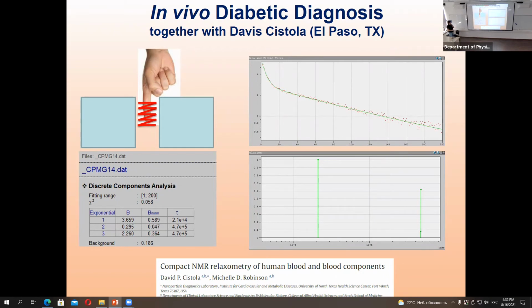in the risk area. And so for him, we built also the magnet that is not really shielded because you are able to put your finger inside. So now he's writing papers and then talking at different conferences. Here is, let's say, the reference. Very interesting project and very useful, by the way, for people. You can put your finger, wait 30 seconds, and then the system predicts whether you are in a risk area or not.